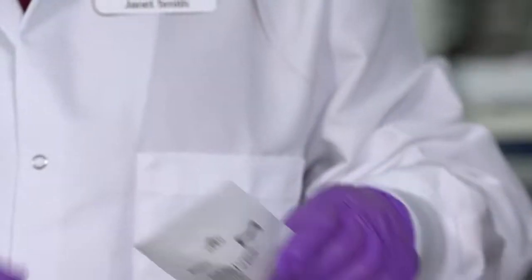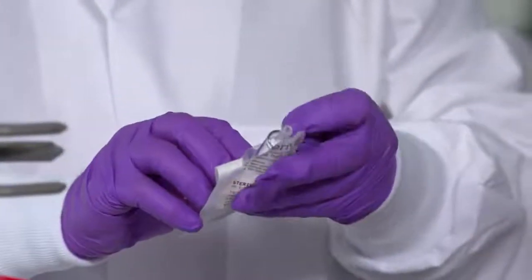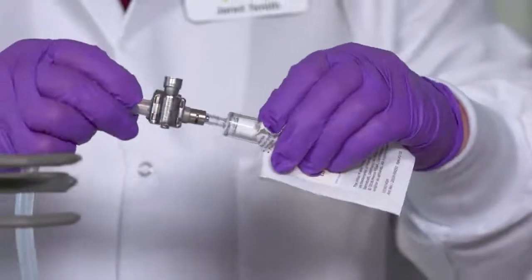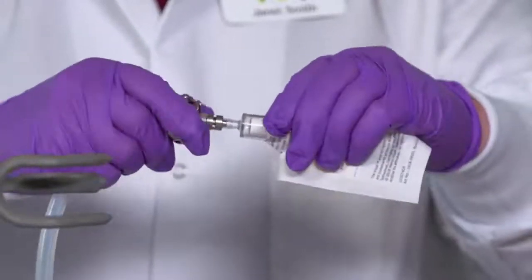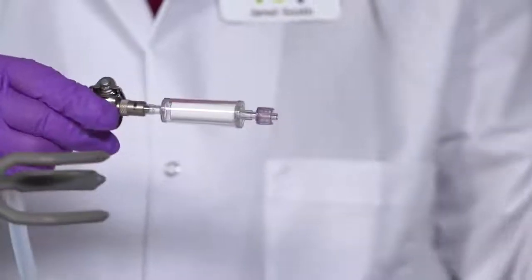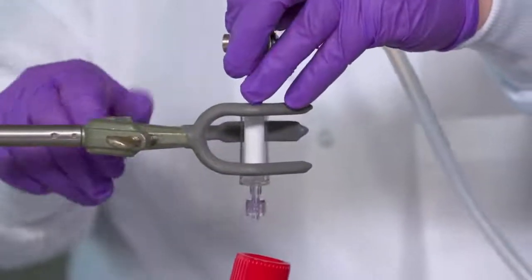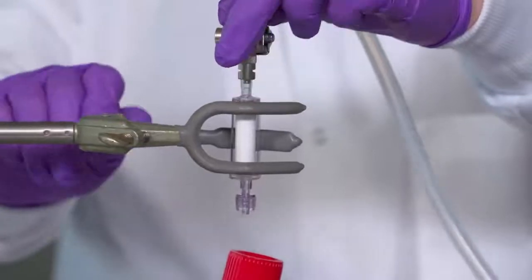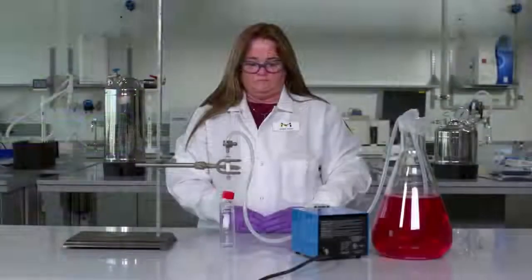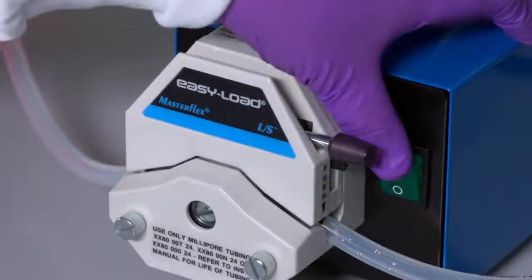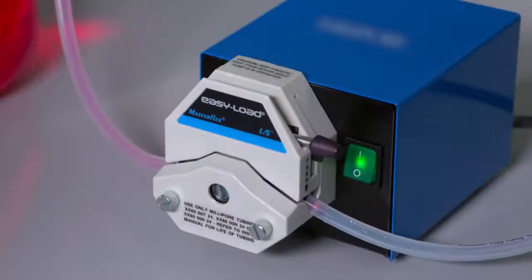Peel open the pouch containing the Sterivex filter unit using aseptic technique. Attach the lure lock end of the hose barbed lure lock adapter to the inlet of the filter unit and withdraw it from the pouch. If desired, connect the unit to a ring stand and place a sterile collection flask under it. Turn on the pump. Start and stop as needed using the pump controls.